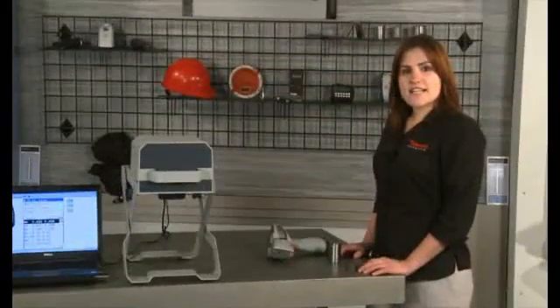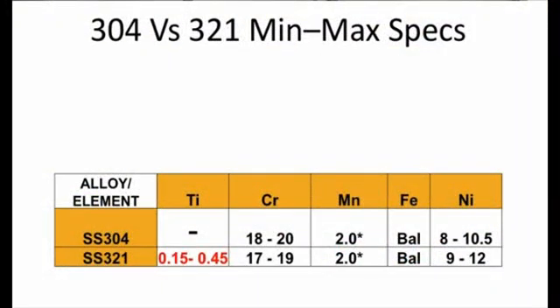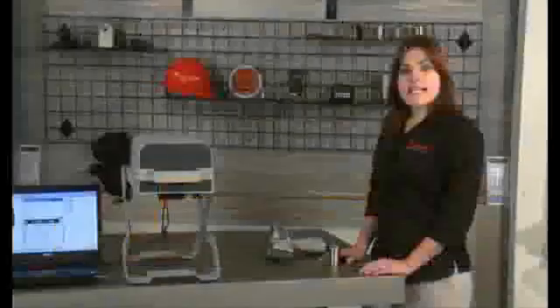An example of a more challenging analysis would be the testing of the nearly twin alloys 304 and 321 stainless steel. These two alloys have overlapping specification ranges for all measurable elements, with the exception of a fraction of a % difference in titanium content. Titanium is added to 321 as a stabilizer for welding and for avoiding stress corrosion cracking with certain corrosive chemical environments. The petrochemical industry must be able to accomplish this difficult alloy separation in order to have absolute confidence that the correct alloy grade is applied to the intended use.